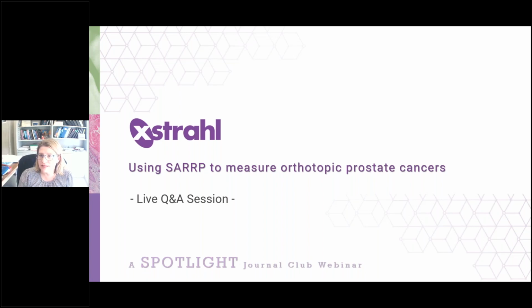And if that remains at 4 millimeters, then likely the tumor in that animal didn't take, and you're measuring a normal prostate. So you really need to know, in each strain of animal that you're working with, what the normal size of a prostate is. And then when you see that it gets larger, you can assume that a tumor is growing in that animal.